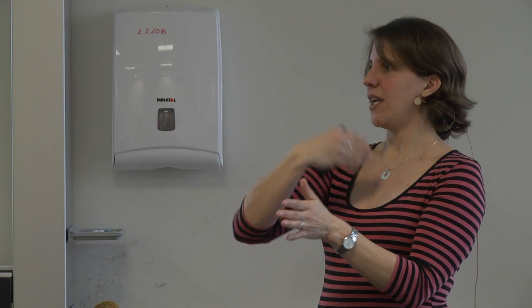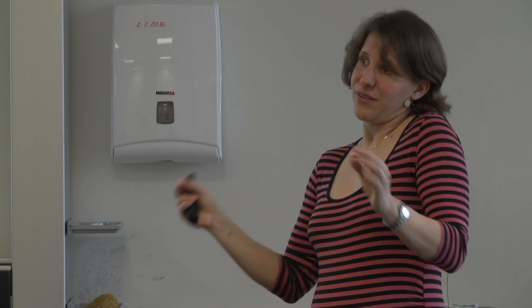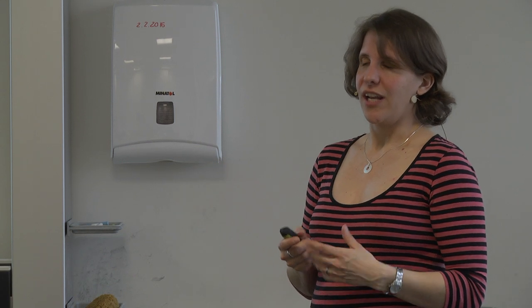We have seen this in this one example yesterday, where when we looked only at the light channel, we couldn't figure out what was the right peptide, but when we added the 15N labeled channel, we increased our confidence in what's going on. And this increase in confidence is especially big when you work with synthetic reference peptides, and you're really very sure, unless you don't trust the company that they sent you the right peptide.